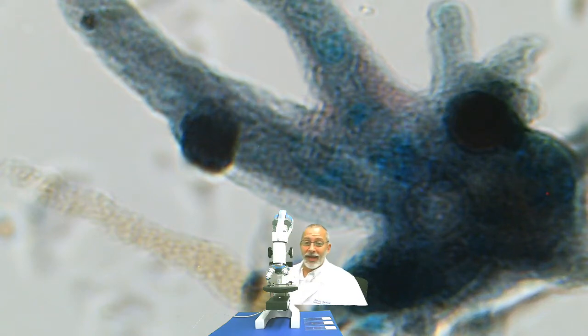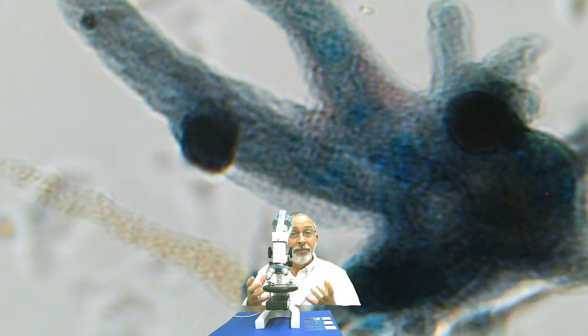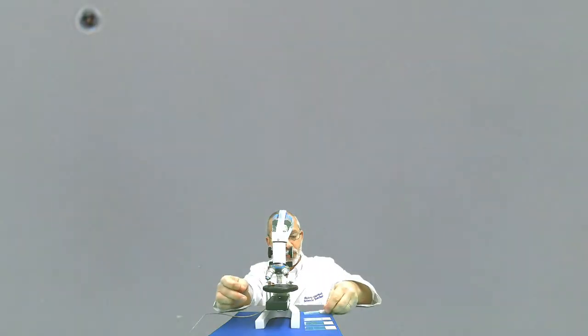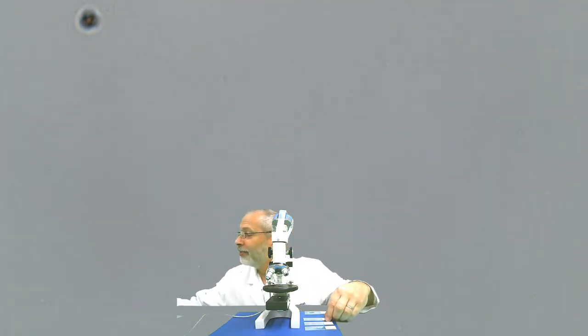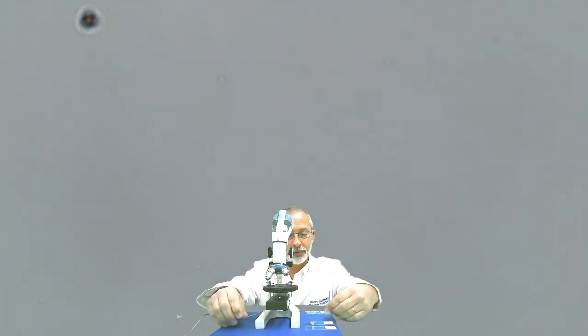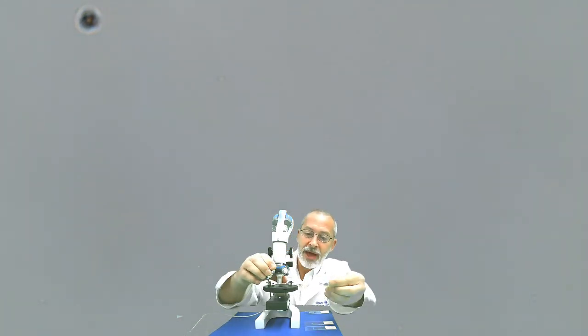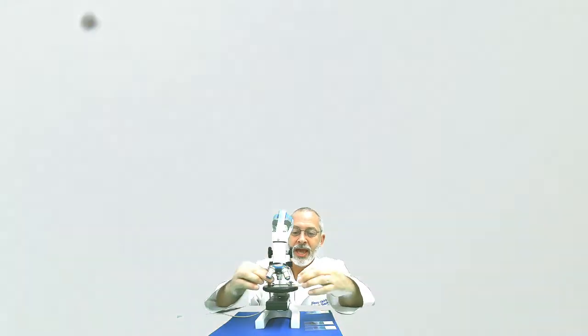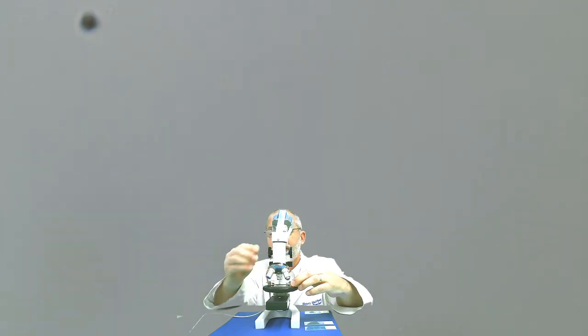All right, we're back. And now we're finished with the amoeba. Make a mental note of the different characteristics or features that you have observed. And again, step 4, size, shape, structure, color. Notice all of those things regarding your amoeba. And now let's move back to the low power, 40 times magnification, as we look at our next specimen, which are the Paramecium.